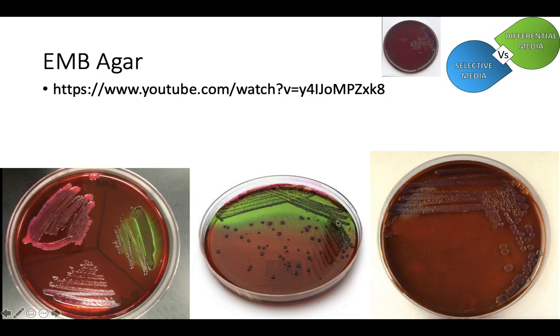Now, this particular agar is specifically really only designed for E. coli. It's used mostly in the food and dairy industry for a very quick test to see if E. coli is present in your food. So, what's going to happen here? If you can grow on this particular plate, you have been able to survive the selective agent, which in this case is eosin and methylene blue, which means you're a gram-negative organism. You survive the selective agent. Now, the differential agent is lactose.